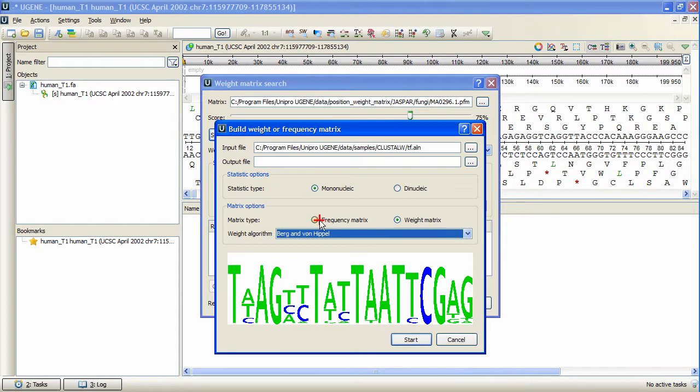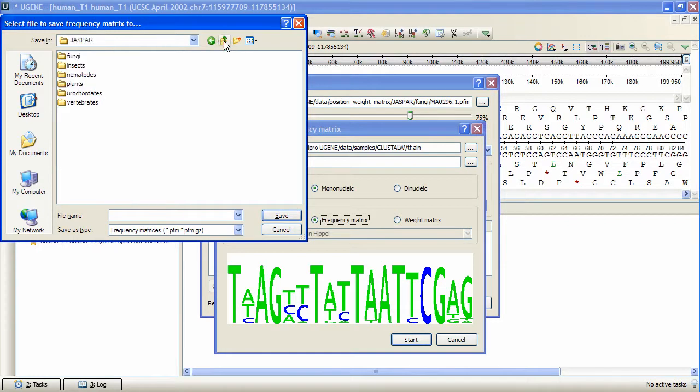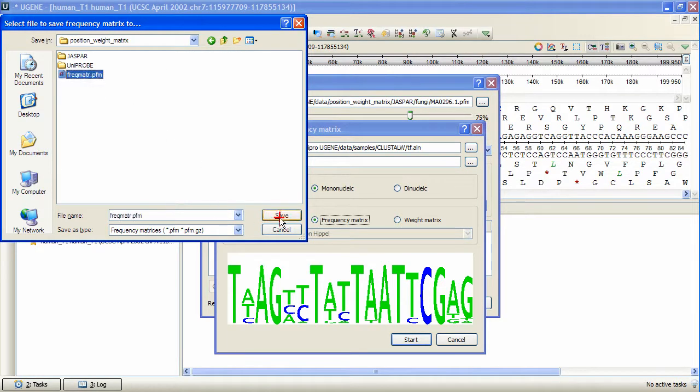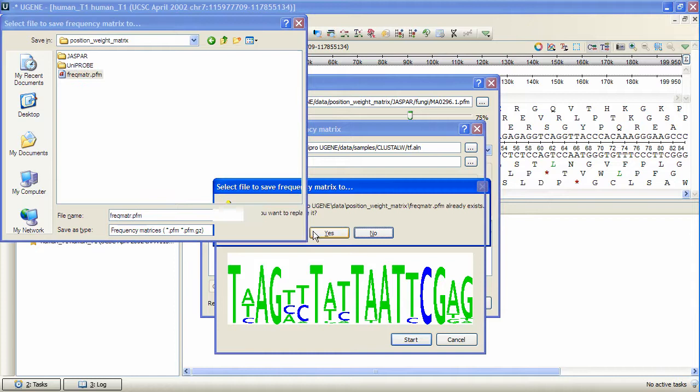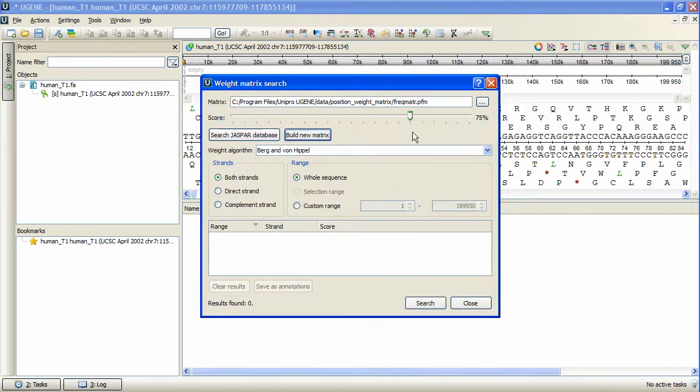Now we need to specify the output file in which the new matrix will be saved. Let's press Start. The matrix has been created and saved, and it has been automatically chosen as the search matrix.